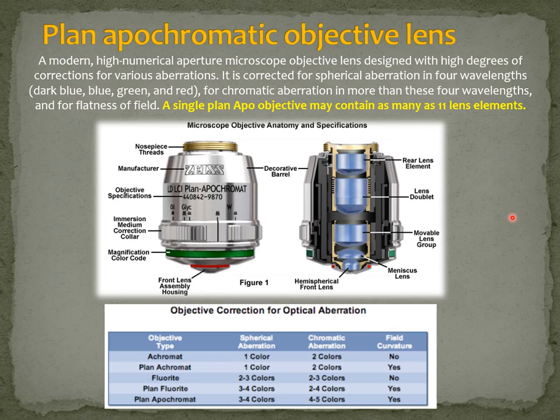Just to remind you that these different aberrations that light can suffer when going through glass were all described by the late 19th century, and manufacturers have been trying to correct them ever since.